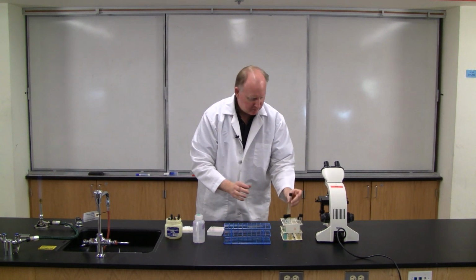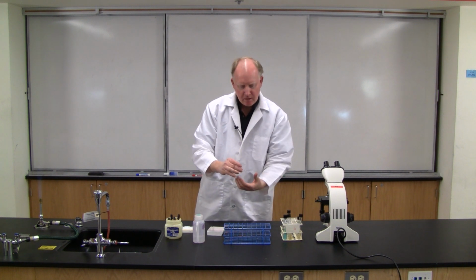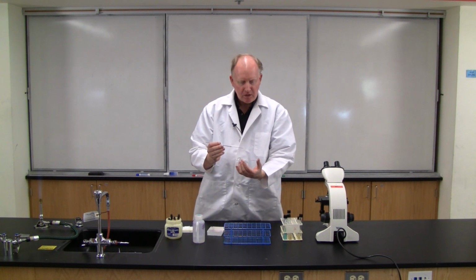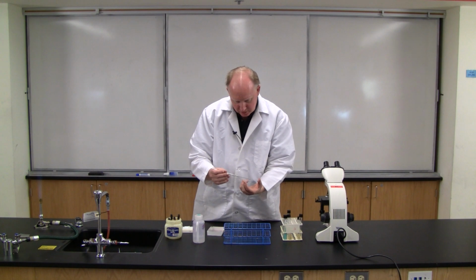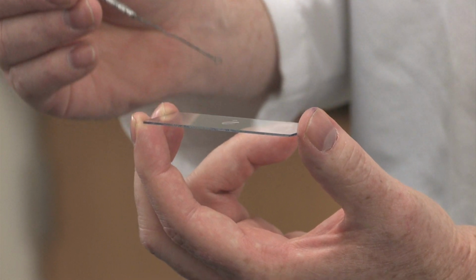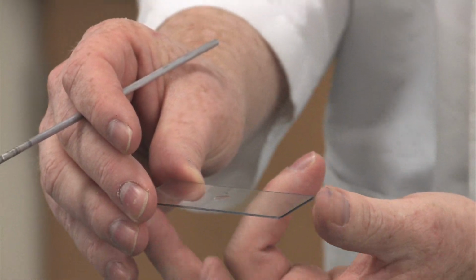Okay, just as we did before. A little tiny bit of bacteria. And we're going to do this a little bit differently. We're not going to be doing a bacterial smearing. We don't want this to dry out. So we're just going to transfer a little bit of bacteria. Just make sure a little bit gets off into the drop without spreading it around too much. So there's plenty of bacteria in there. You can even see that it's a bit cloudy.